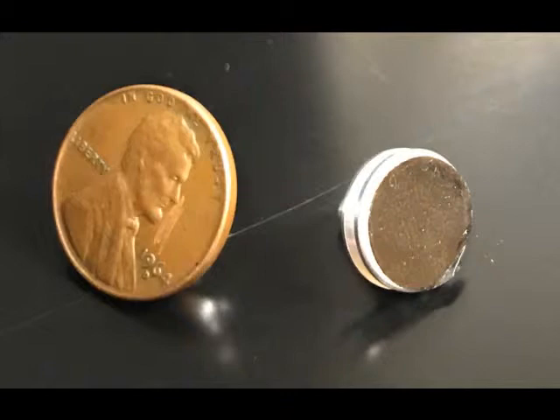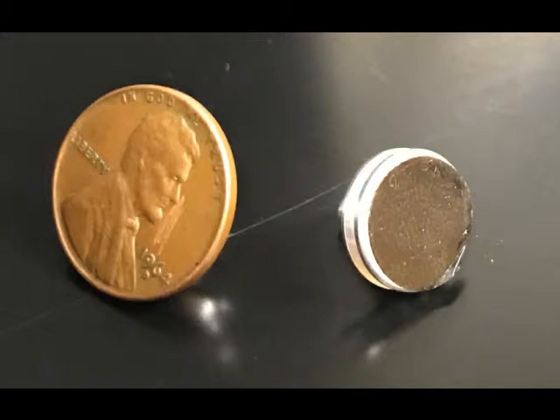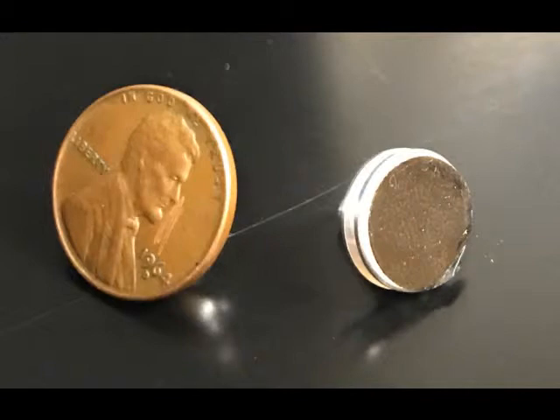The object over on the right is the SEM stub that we use for mounting. It is a simple aluminum disc with a little pin out the back that allows us to mount in the machine, and the black thing on the surface of that is a double-sided sticky tape that has a lot of carbon in it, and it allows us to conduct electricity. So the electron beam will come down, strike the penny, and then pass through that tape and through the aluminum stub, and hence out the machine. It's part of how you prepare your samples.